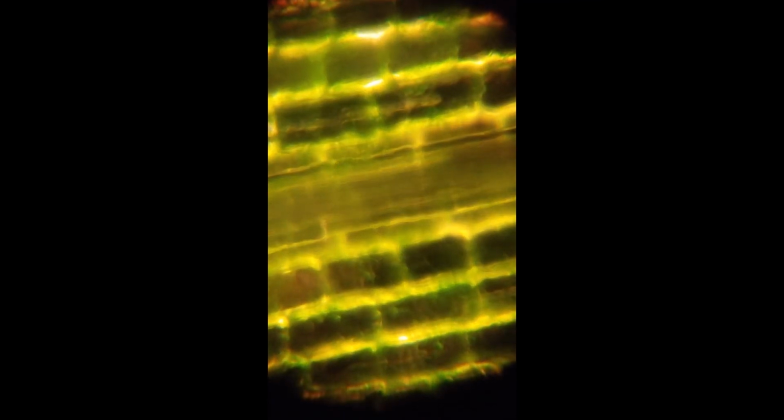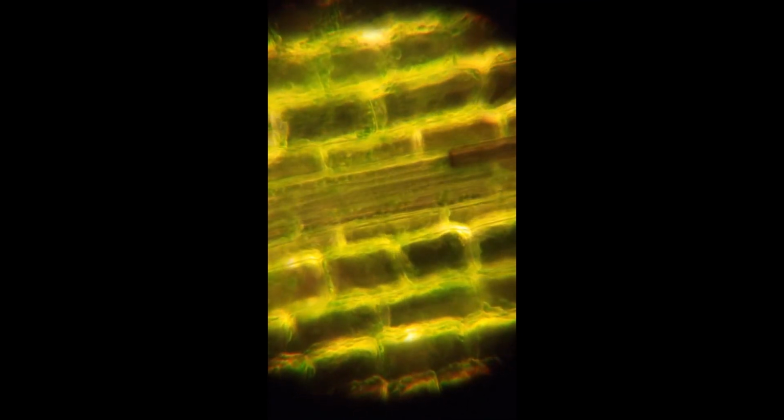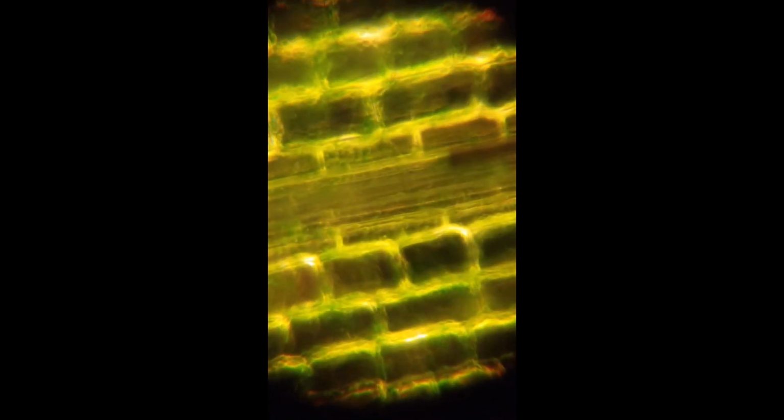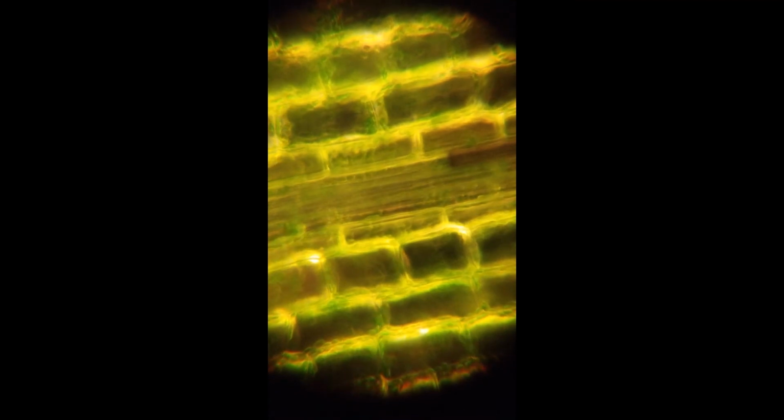You can see them moving around in the plant cells, streaming through. I just wanted to share this because it looks like a nice lava lamp almost.